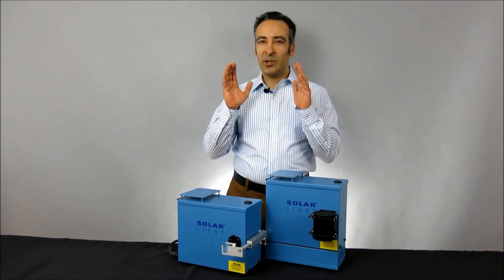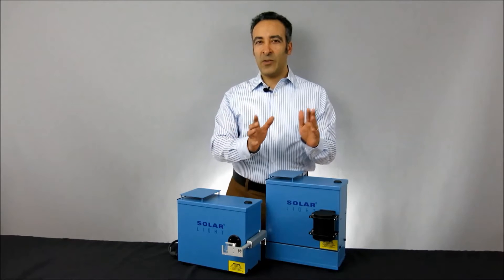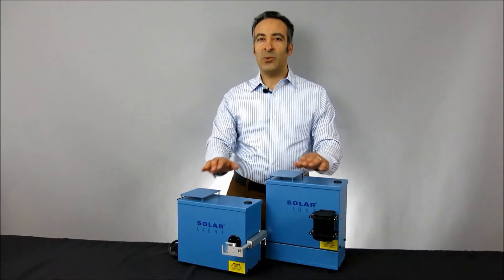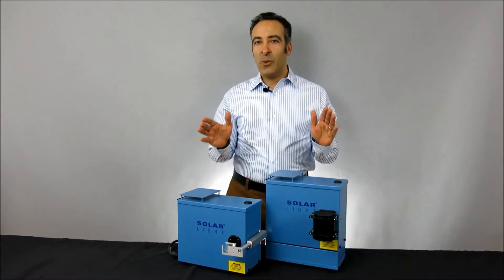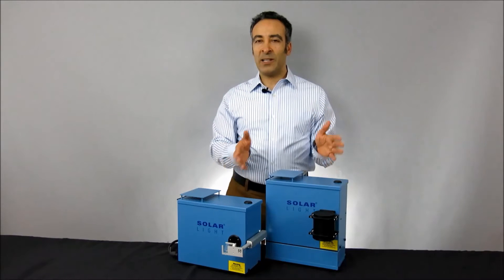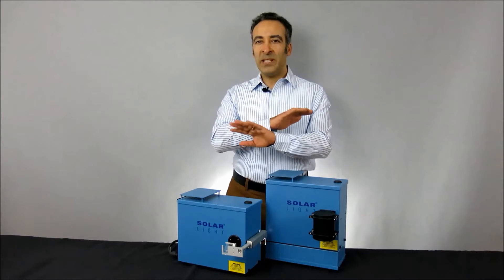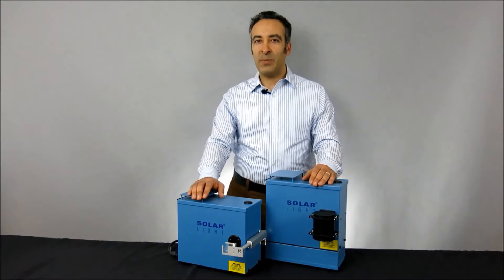Solar Light's 16S-series simulators are high-precision light sources for both professional and laboratory applications. Although they're utilized worldwide for many different functions, we've combined these simulators with our high-quality meters, dose controllers, sensors, and other hardware to create complete turnkey kits for the most popular applications.